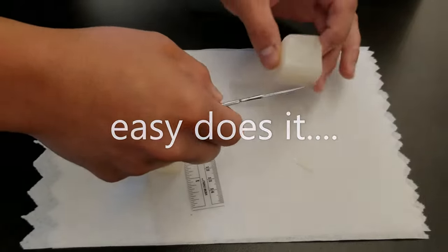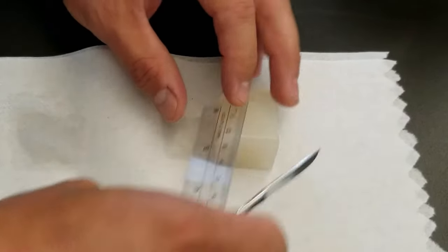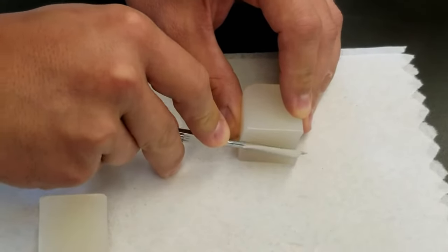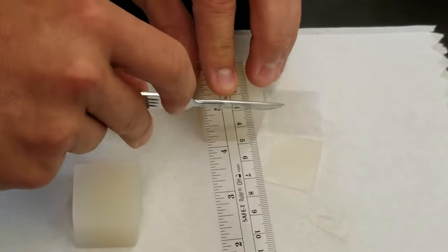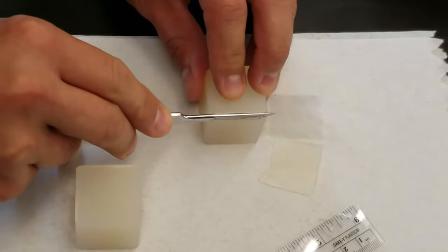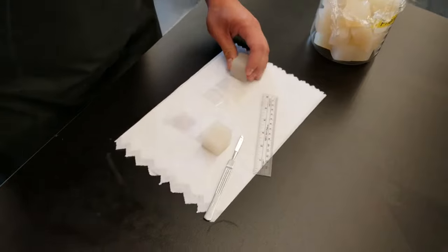Just trim a little bit off, then flip the cube the other way, take another measurement, and trim again — because these larger cubes are just about the right size to start. Then in the third dimension, one more measurement and one more cut to get our accurate cube. Notice my fingers are away from the blade so I can make a nice cut and be safe. Ultimately, this is what we end up with after cutting all three size cubes.